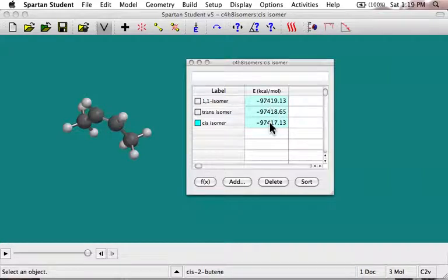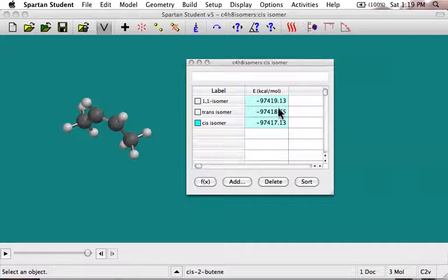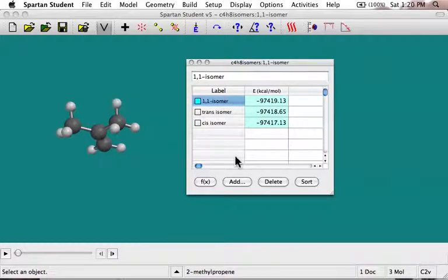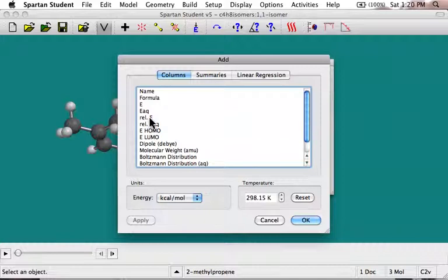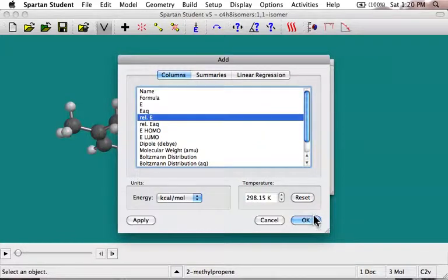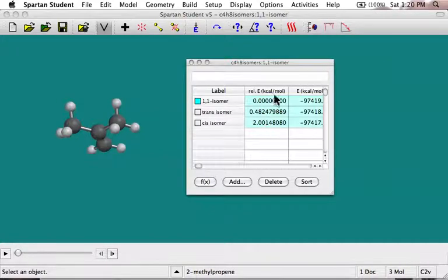Now let's say we wanted to compare the relative energy. These are negative numbers, so the larger negative number is the lower energy — but it's kind of hard to compare them directly. It would be nice to express them all relative to the lowest energy one. So I'll click on that one and add another column: relative energy. That one I selected is at zero, our trans isomer is at essentially 0.5 kcal per mole, and our cis isomer is 2 kcal per mole above that.